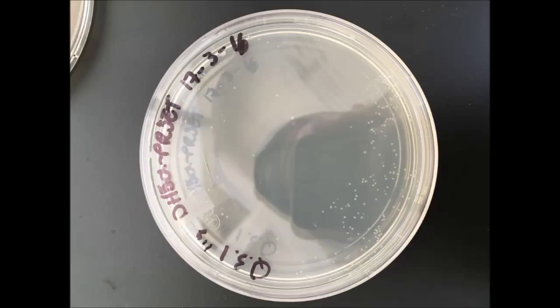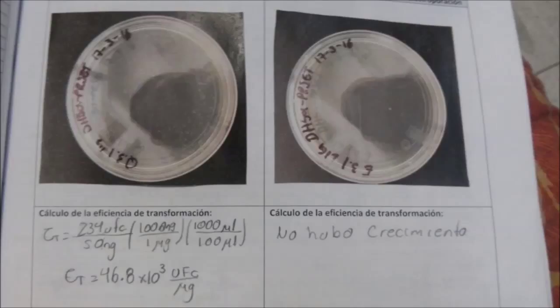To conclude, it is necessary that in a genetic engineering laboratory, we can generate competent cells that can replicate and express the genes that are inserted in them. It is necessary for cloning vectors and generating libraries, as well as obtaining recombinant proteins. It is necessary to check the electroporator since it isn't normal to obtain such a low yield.